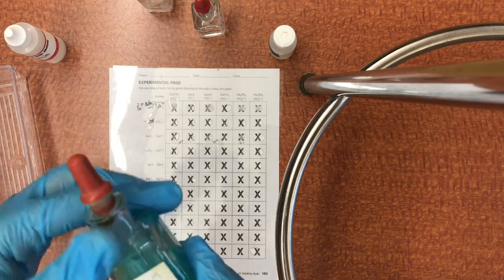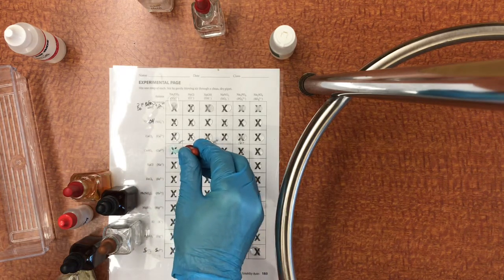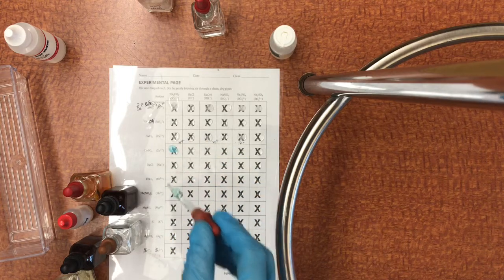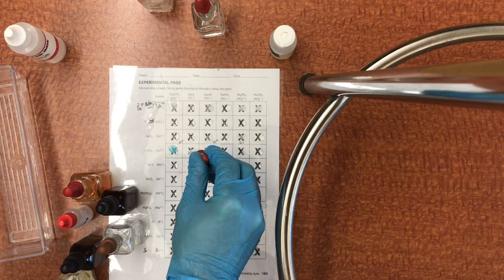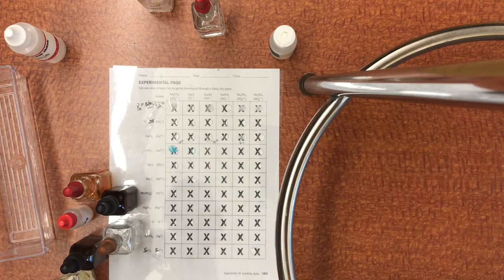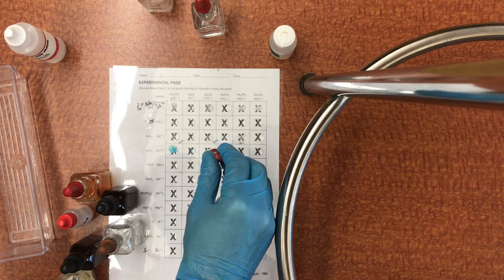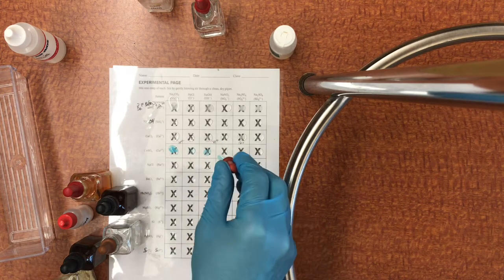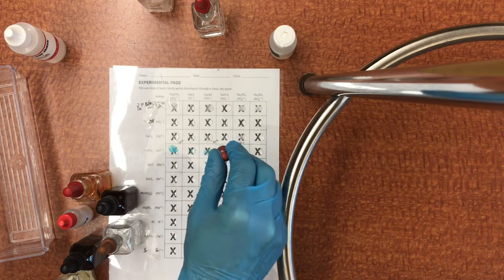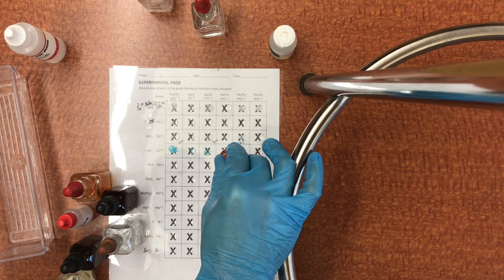Okay, this is copper sulfate. So copper sulfate's blue in color. So let's see what happens here. Oh, you can see a very distinct splotch there. That is the precipitate reaction. If it's blue in color, that's okay. That's just the dissolved copper, but here you can see with the copper hydroxide, you can actually see a powder that is forming.